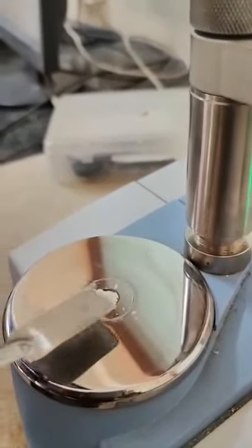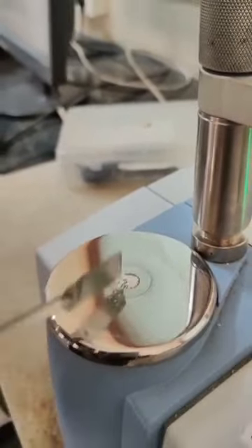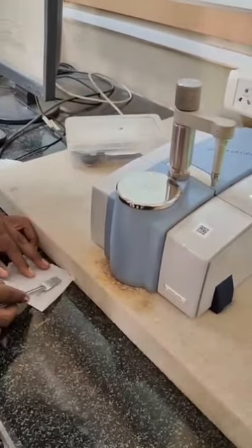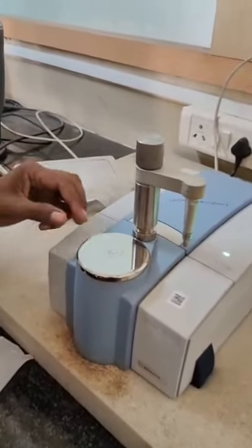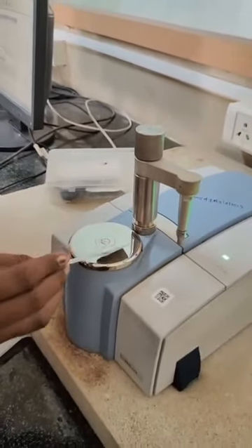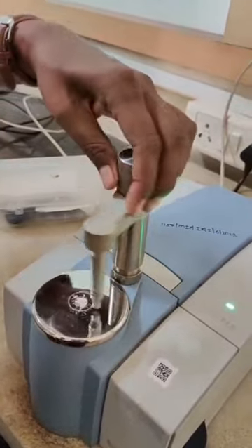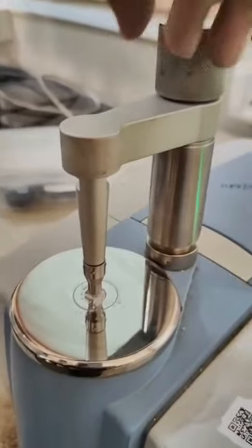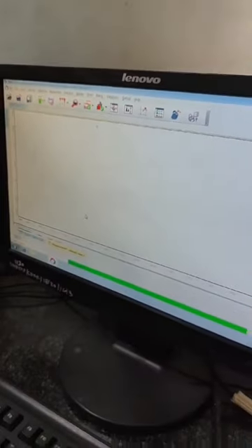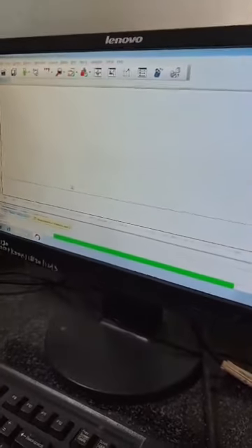We need to spread the sample properly on this crystal. A very small amount of sample can be analyzed using this IR instrument — it is a highly sensitive instrument used for functional group identification. Very little amount of sample is required for this analysis. For a solid sample, we move the knob back to position and then click on 'Start Sample Measurement.'